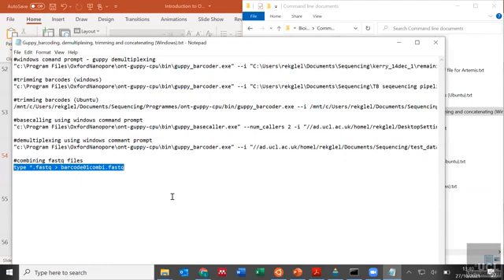So yeah, I agree. I thought I would have to use some actual program, but you should just be able to do it because all it's doing is telling the computer to just copy and paste everything into one file. So it's in theory not actually too difficult in terms of commanding. Yeah. Perfect. Does that make sense?